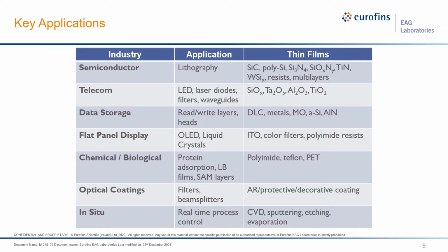Also, as a result of technological advances, especially the huge increase in computing power, ellipsometry has evolved from a slow manual technique to the fast, fully automated technique it is today, thereby also contributing to its proliferation.